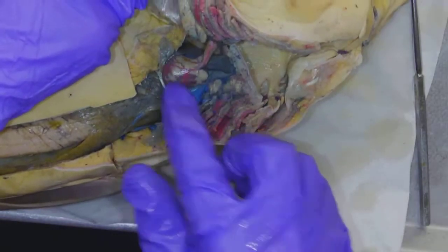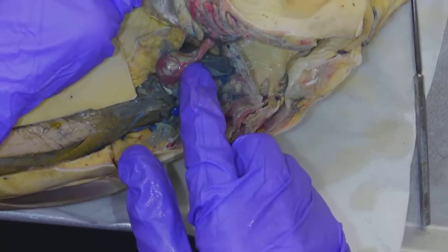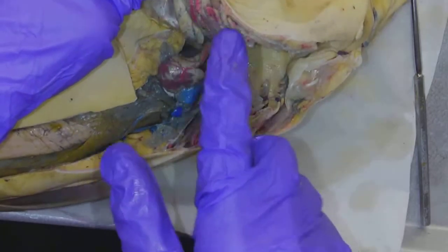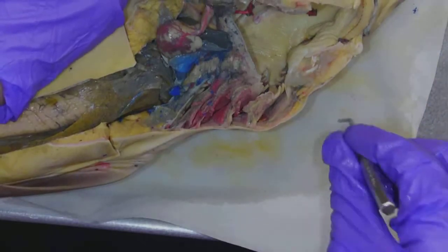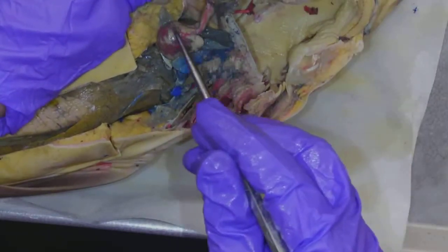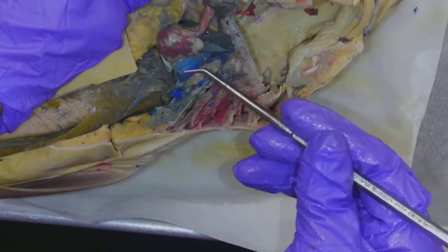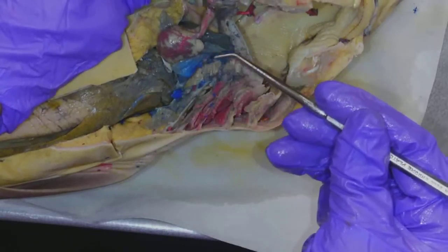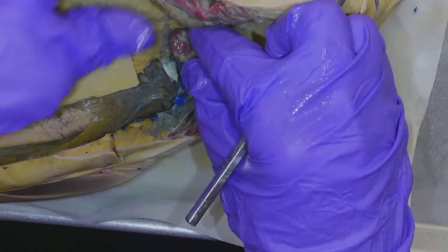Right here is the heart. The heart is located right close to the gills, because the heart is going to be pumping blood to the rest of the body and back and forth to the gills — for getting oxygen to the body and carbon dioxide out, just happening in water. I can see the ventricle of the heart here, and this part here is the atrium.